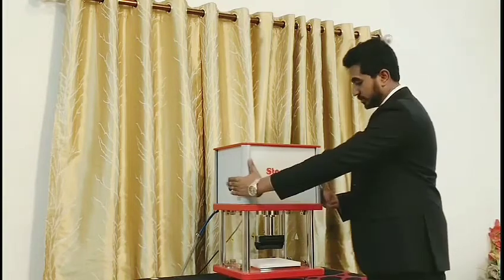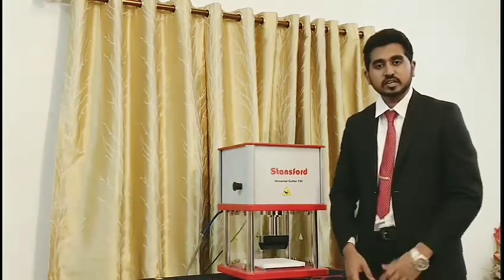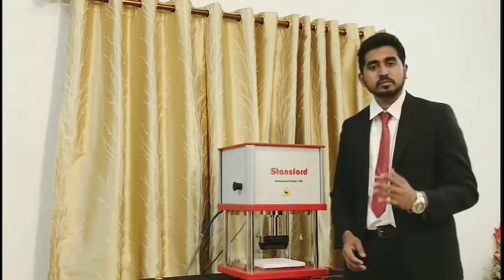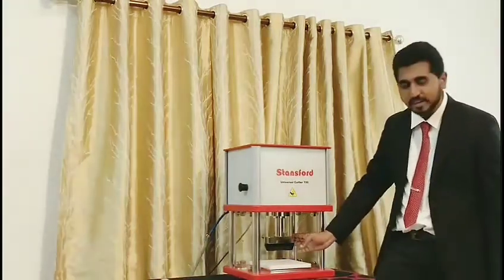This machine consists of two dual switch operations, surrounded with acrylic glass. This cutter is used to cut Mooney, dumbbell die and MTR samples. It is made as per ASTM standard.